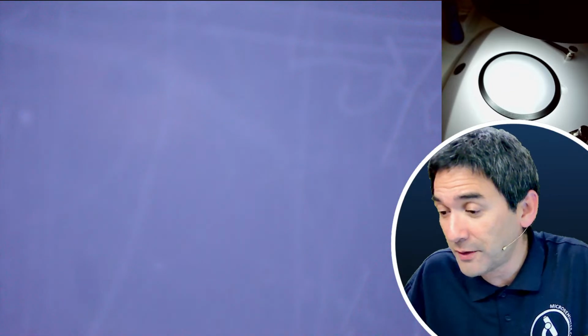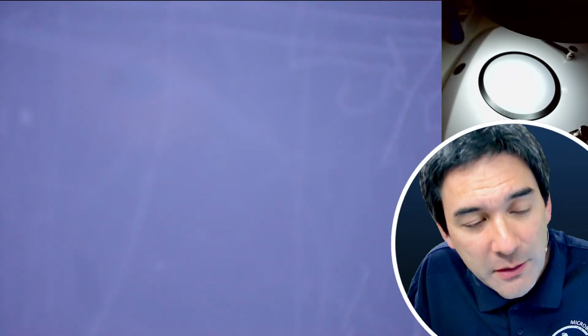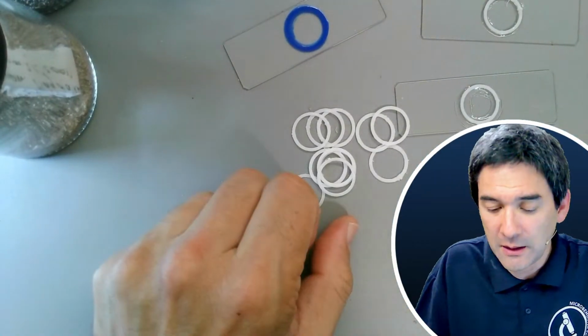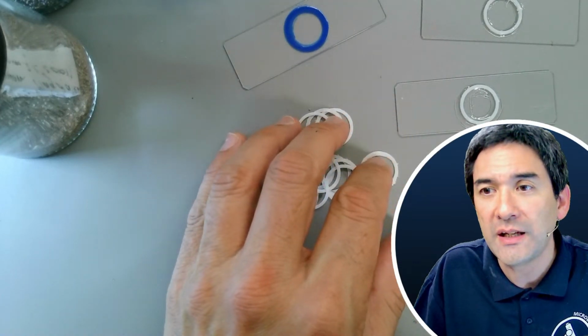It's gonna be a little bit experimental, and those of you who have joined the live stream in the past already know that I'm not giving perfect demonstrations, but it should be rather a motivation to try the things yourself. See, I have to switch around the camera every time again.